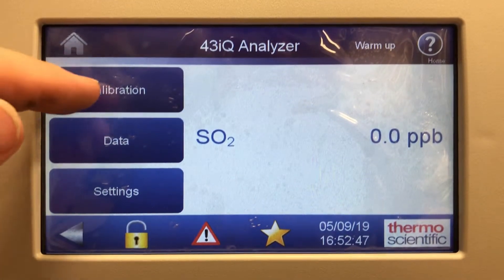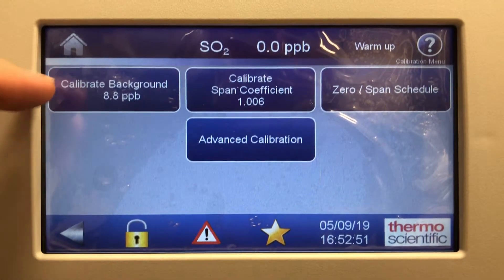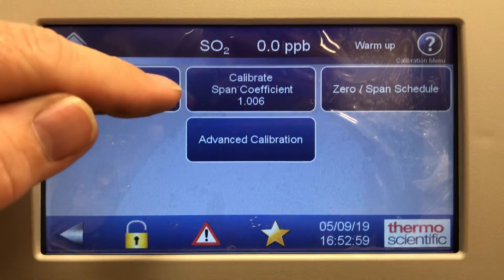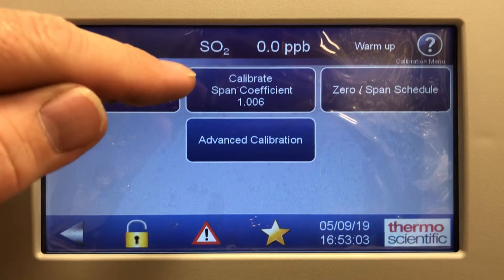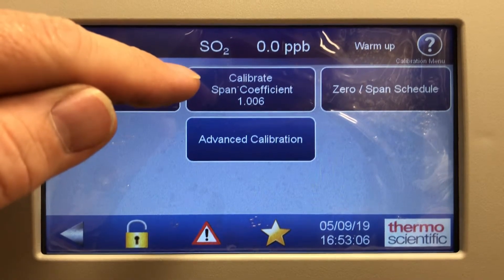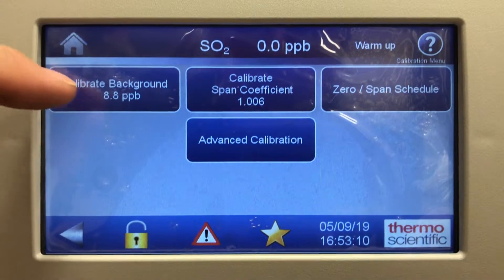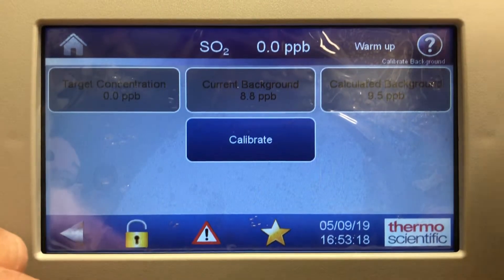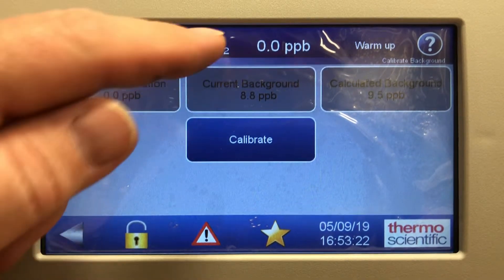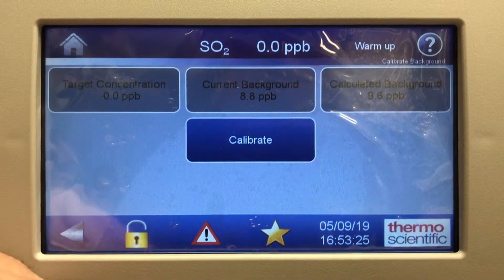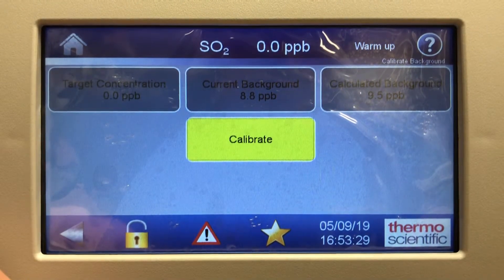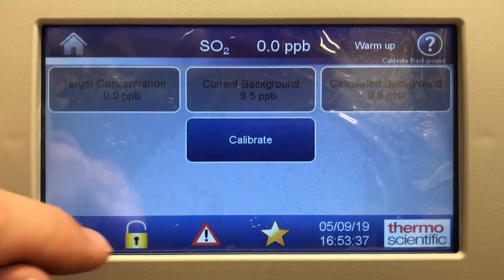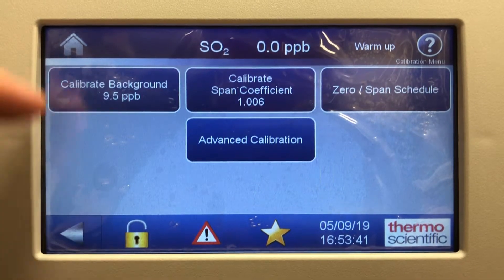Looking at the calibration screen, the first option is calibrate background — this is where you would do the zero adjust. It's currently showing 8.8 ppb background. On this instrument, it's zeroed and reading zero right now, so if you're sampling zero error, you simply hit calibrate and the instrument will do a background adjust. It changed to 9.5 background when I did the cal adjust.